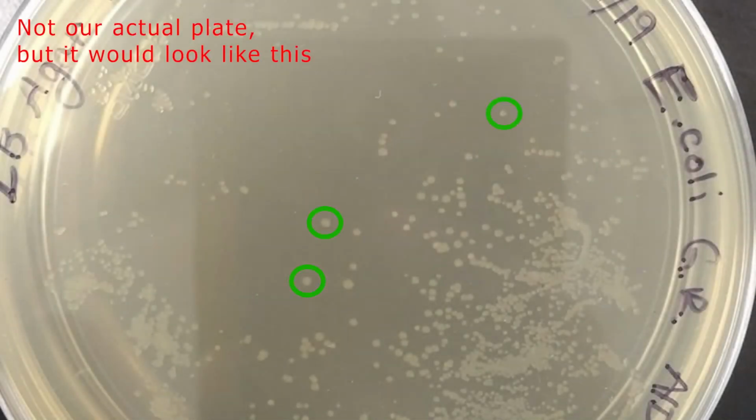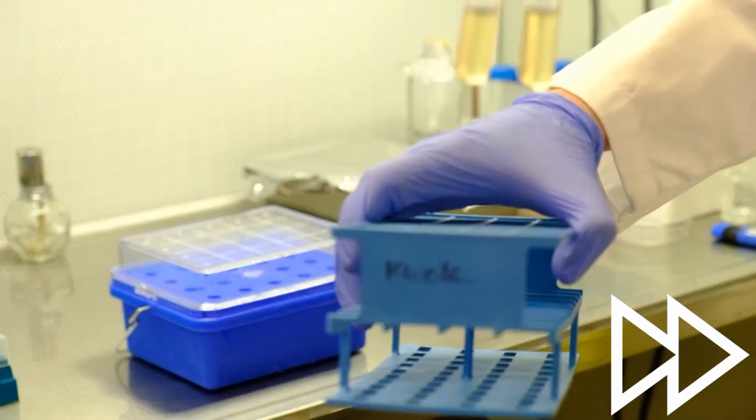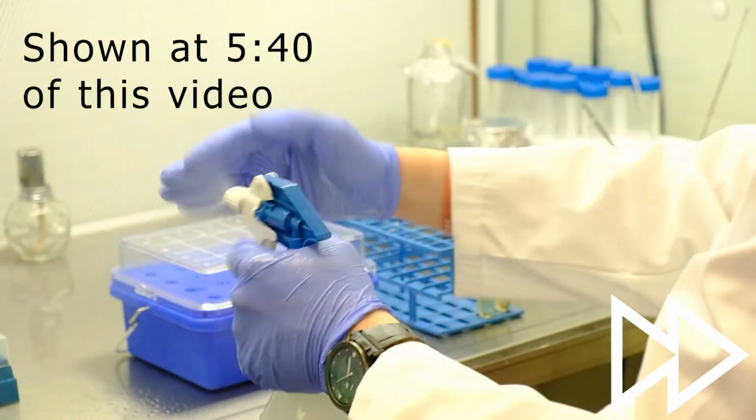Pick a few that are separate from the others and are of simple round shape. Misshaped spots might actually be clusters of small colonies. You don't want to have that in the culture. Use your selected colonies to inoculate cultures of liquid media.